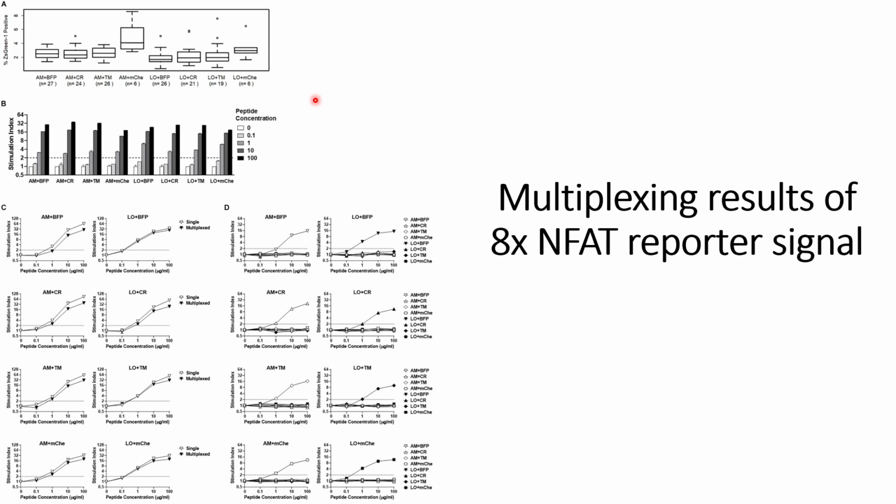In order to check that, they used two different fluorescence combinations for each cell line. First they checked the resting ZS green signals, and they can see that in most of the cases the resting ZS green signal is lower, except for one case where the percentage of ZS green signal is higher. These results are for the unstimulated, or non-activated, T cells. However, the researchers said that this increase is also within the range to distinguish between activated T cell signals and non-activated T cell signals.